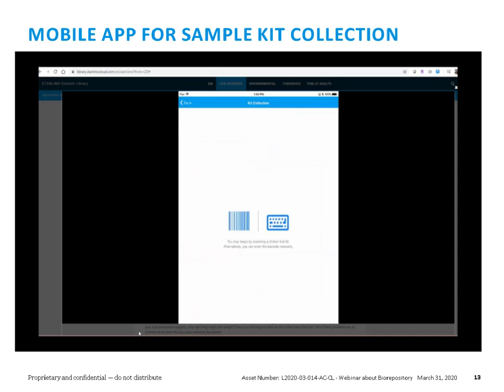All of this sample collection data would already be available in the LIMS, reducing the room for error when transcribing from a paper to the system, to the LIMS, and also making it faster to receive the samples. These mobile applications can also be available in two modes, offline and online. So for instance, if for some reason the clinical site, or wherever the sample collection is done, has no connectivity to the internet, this information can also be loaded in offline mode, and then once you get connectivity, all the data from the mobile app will be submitted and pushed to the LIMS.